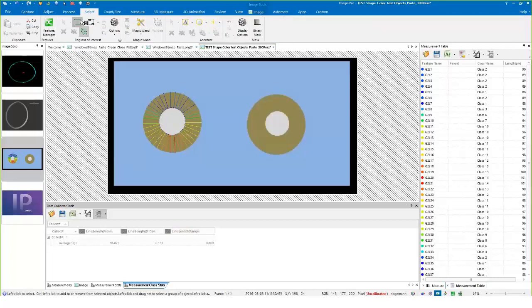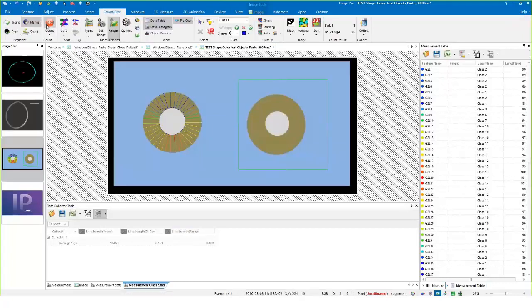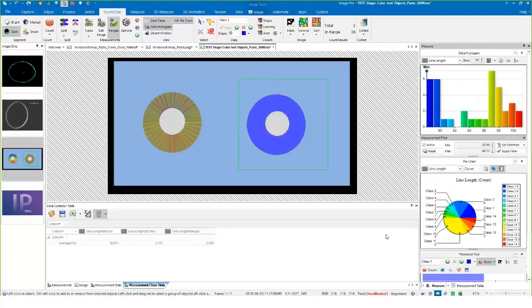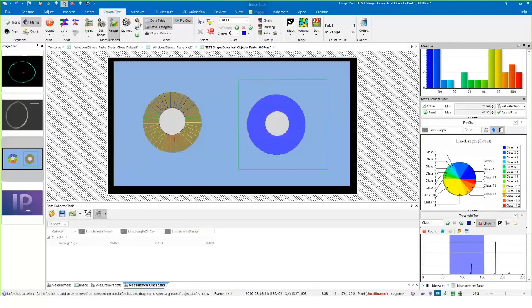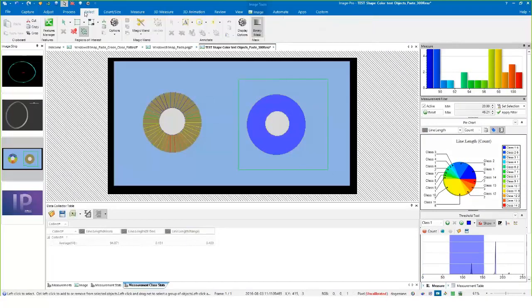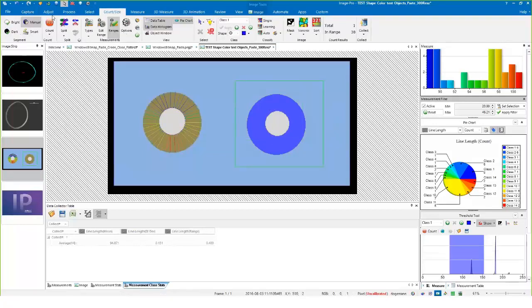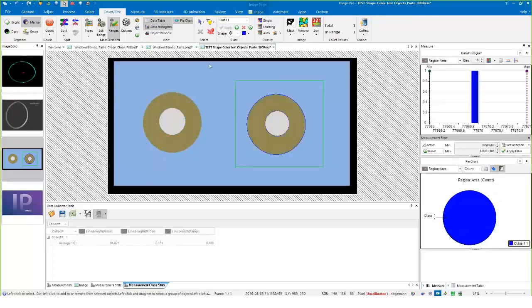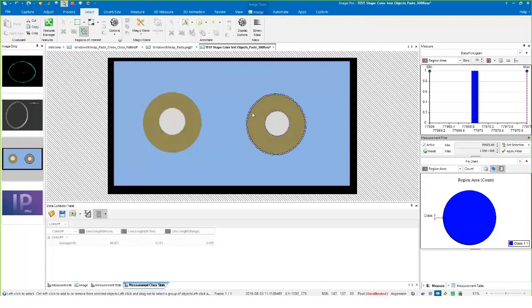If I wanted to go through now secondarily and choose another object in the field of view like this one, then go to Count Size, tell it it's a dark object, I'll do my segmentation here like that. Then I just get rid of the actual region there. Now, oops I did it again, do a region and we actually want to do a count of that. Now I can get rid of my ROI, highlight the actual object itself in the lines.